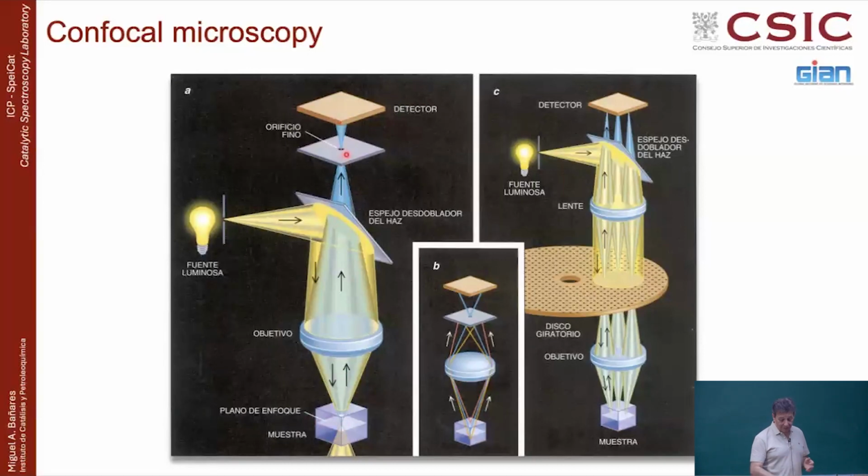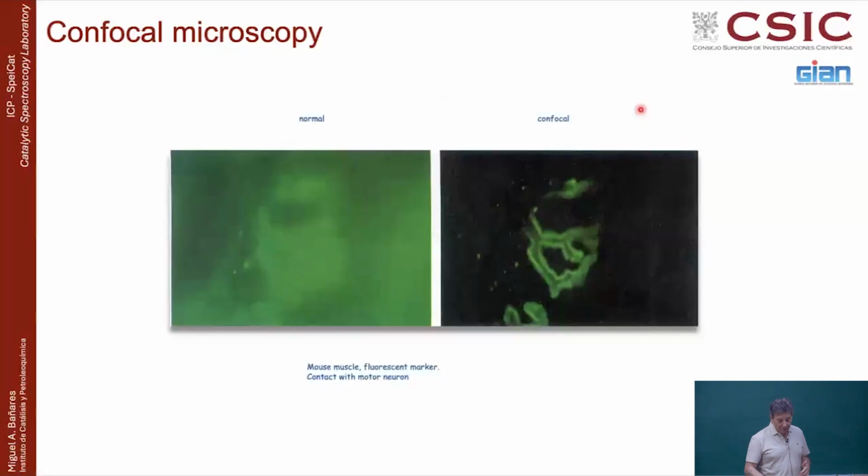So what they do in the microscopes is that you get a rotating disc full of pinholes. Because it is rotating, it is basically describing a confocal plane. Anything in this confocal plane will go through the filter to the detector, and anything above or below this confocal plane will be stopped by this disc, so that you can get the confocal image on a given surface through this kind of technology. This is typically used in biology, in fluorescence microscopy, to observe things.